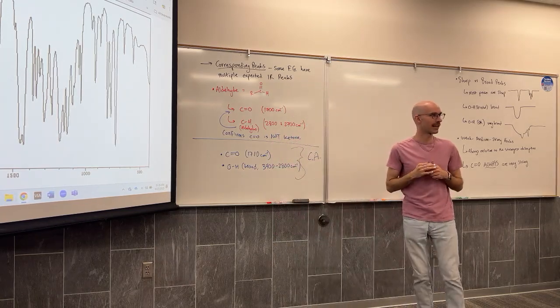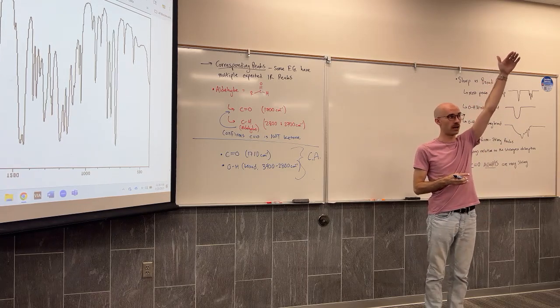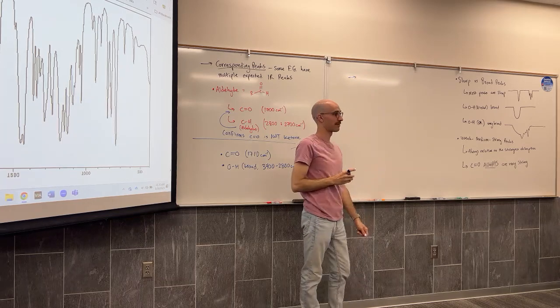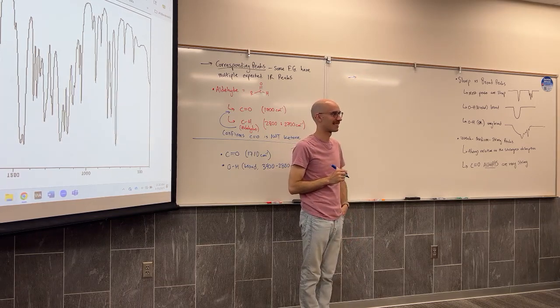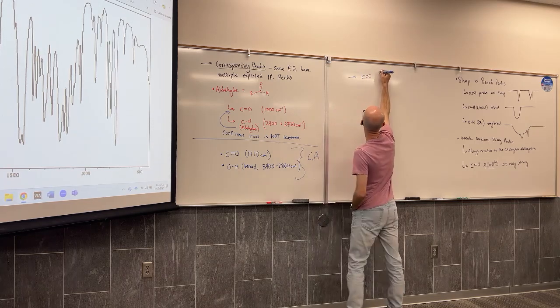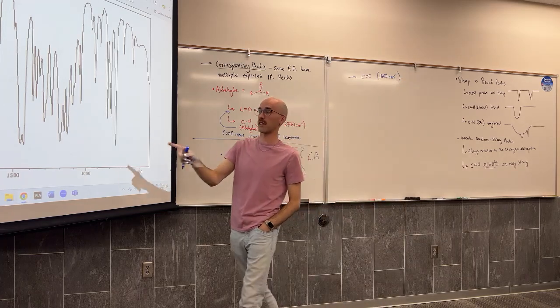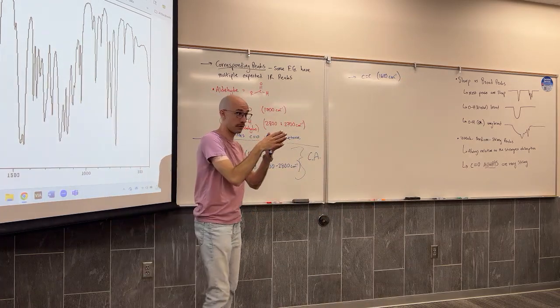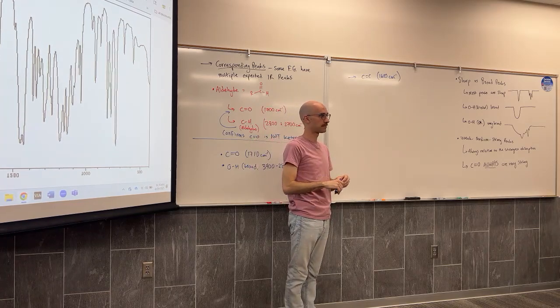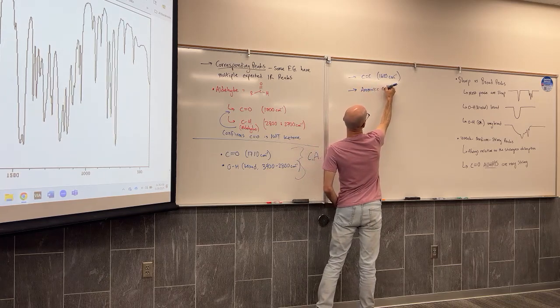Okay guys, we're out of time, so tell me what you found. What do you feel most confident is present here? Aromatic. No, that's not a bond type. Sorry, bond type. CC of the aromatic. CC double bond, tell me where you found it. 1600. Okay. Now, the aromatic ring's not the only thing that absorbs at 1600. Other things, 1600 is within the range, like the NH of an amine. It's also got the overtones. Good. Aromatic overtones are there.